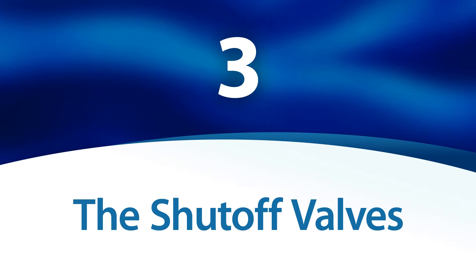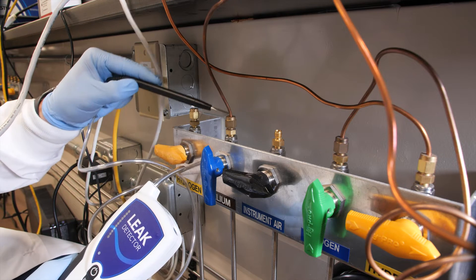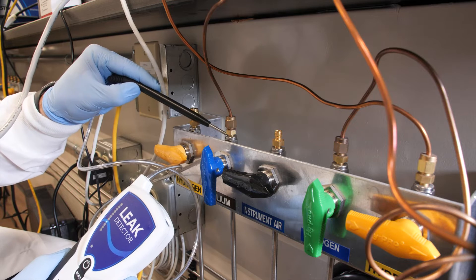The shutoff valves. Moving parts can be more prone to leaking as they age and wear, so be sure to check the shutoff valves. A replacement may be necessary if you find a leak.